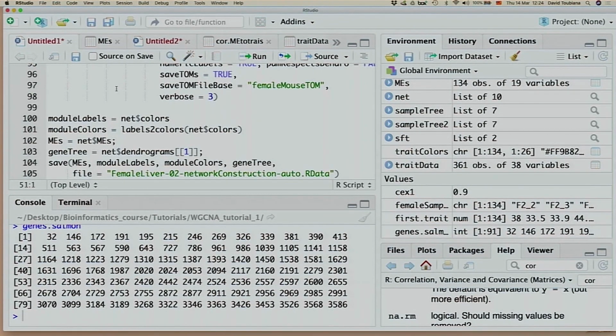It's called the genetic algorithm. It uses the principles of evolution, and it's an optimization algorithm. But we won't go into this. Once it becomes available, you can just use it. Then, once you have only 40, 50 genes, you can inspect them manually again. It's much easier to look at 40, 50 genes rather than 1,000, 1,500 genes.